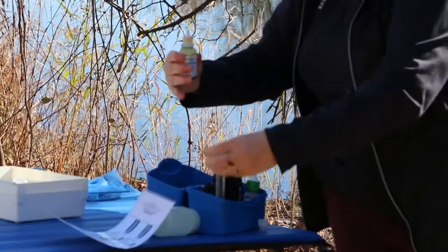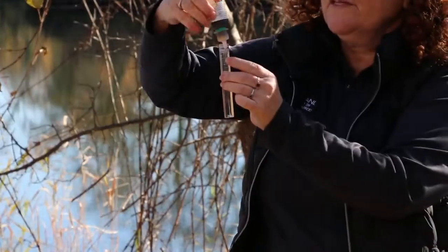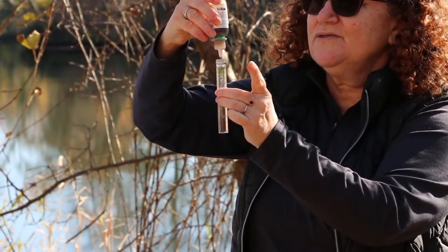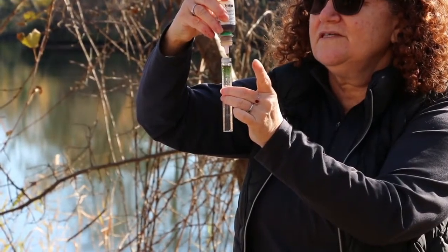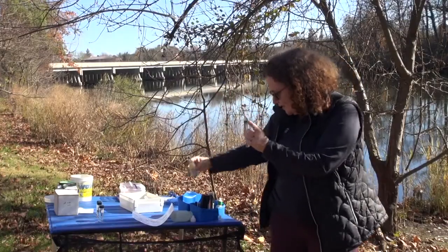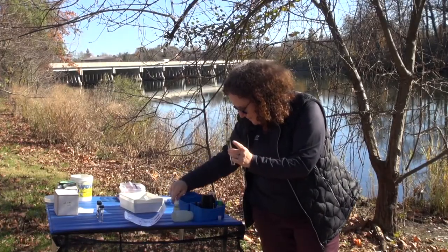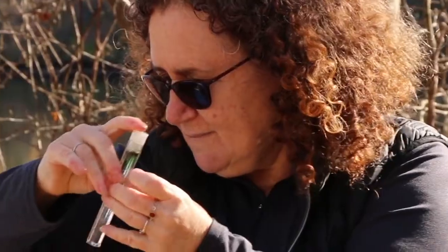My next step 2 says to add 10 drops of the wide range reagent. So I'm going to carefully count out 10 drops — 1, 2, 3, 4, 5, 6, 7, 8, 9, 10. Go slowly so you don't get more drops than you need. I'm going to recap the reagent, then cap my test tube. It screws in, and I'm going to gently mix it.